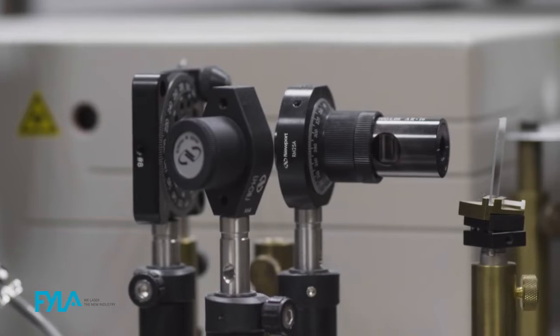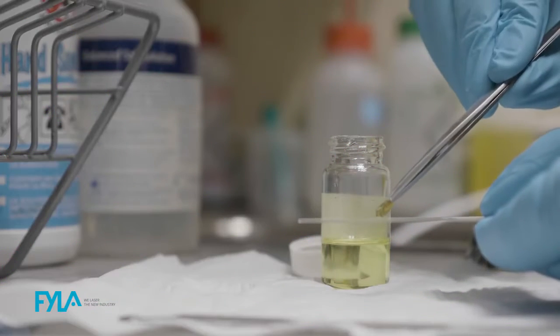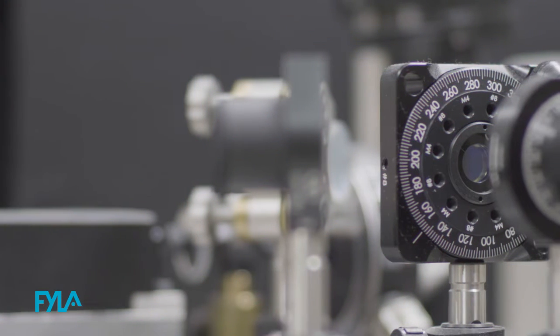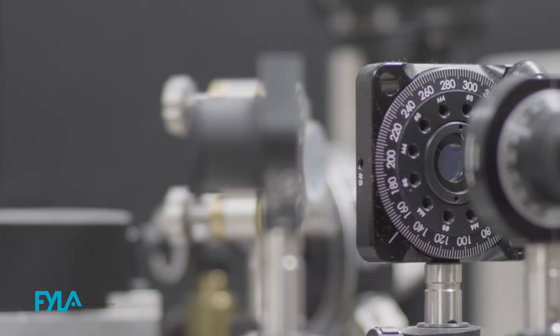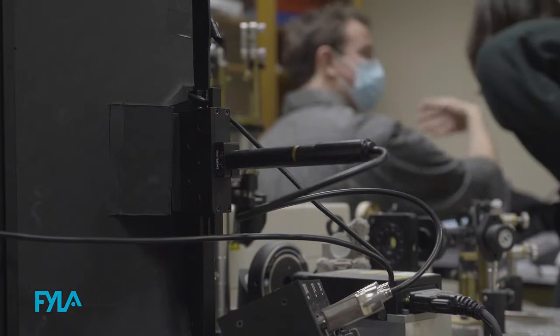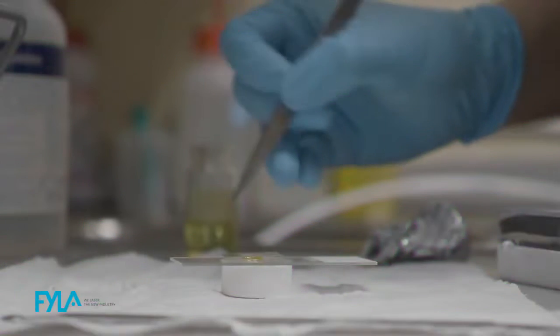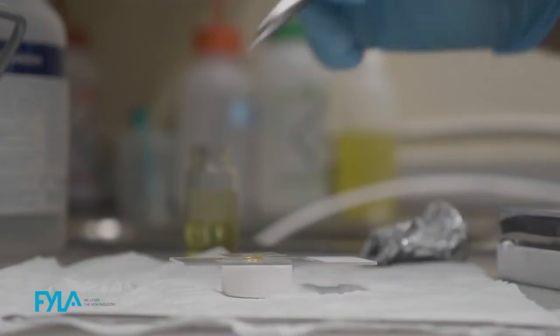Second harmonic generation, or SHG microscopy, is a powerful technique for label-free imaging of collagen present in the cornea and sclera of the eye. Its high sensitivity enables imaging of the structural changes of collagen fibers related to eye tissue malformations and diseases such as keratoconus and myopia.